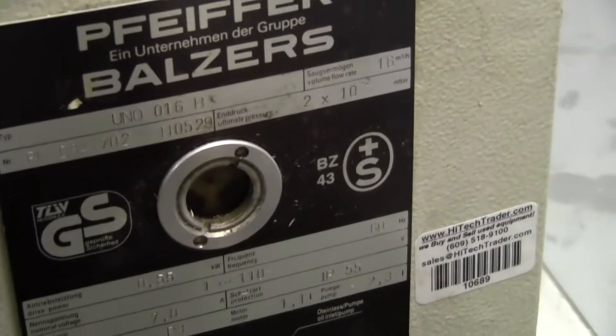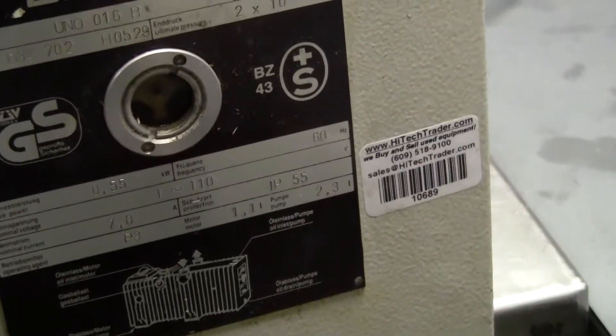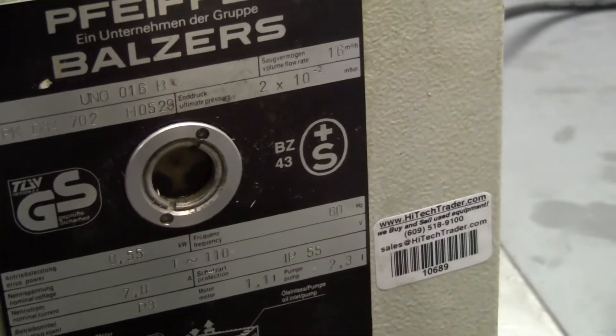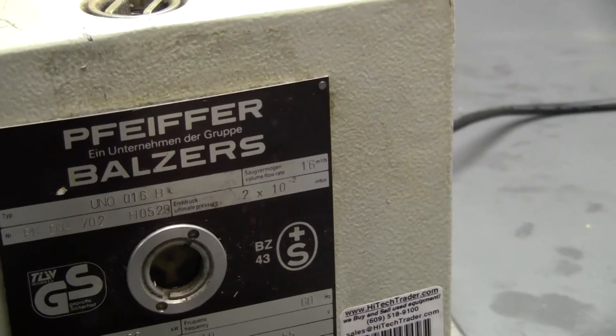The model number is UNO016B, B as in boy. Supposed to pull down 2 times 10 to the minus 2.